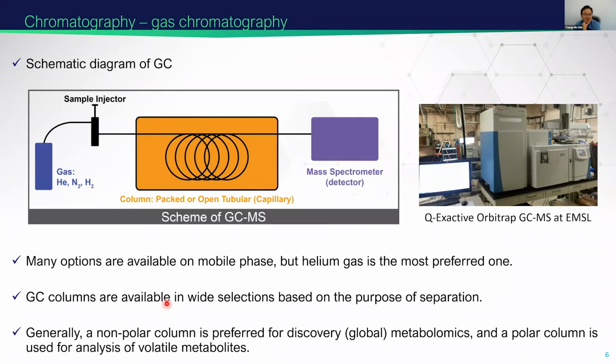So this is a simple scheme of gas chromatography, and there is a gas here. It goes through the whole system until all the analytes reach the mass spectrometer. And the fundamental thing in gas chromatography is using heat.